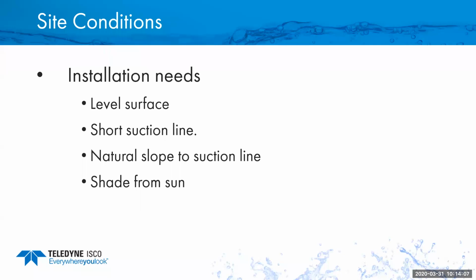Here are some actual setup recommendations when you take your sampler to the site and set it up. You always want a level surface to sit the sampler on. If not, the sampler could roll away in wind, or in a multiple bottle situation, if the sampler is tilted, some of the water may drift off to the side and not make it into the bottle.